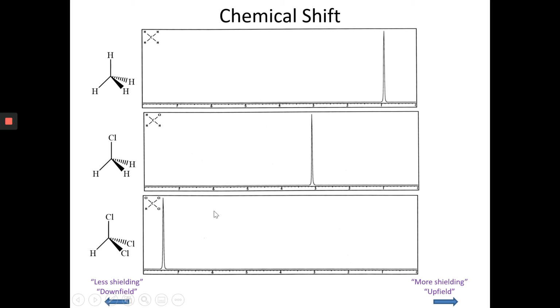But something that you should notice, if you have your yellow sample proton NMR chemical shift handout, please grab that out. One of the things that you notice up at the top where it says primary, that's if you have a hydrogen attached to a carbon where it's on the end. And of course, methyl is even one step above primary. But look over there where it says chemical shift. It has that little funky delta symbol. Delta is the abbreviation or symbol for chemical shift. And of course, ppm in parentheses, that's the unit we're talking about. So the unit is ppm. That little lowercase Greek delta is the symbol for chemical shift.